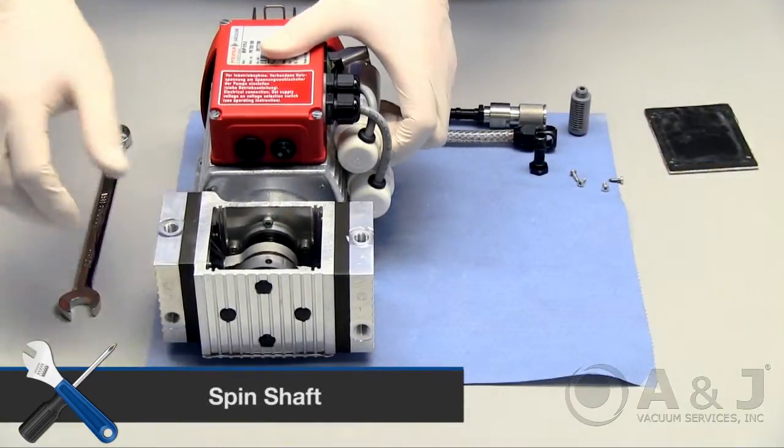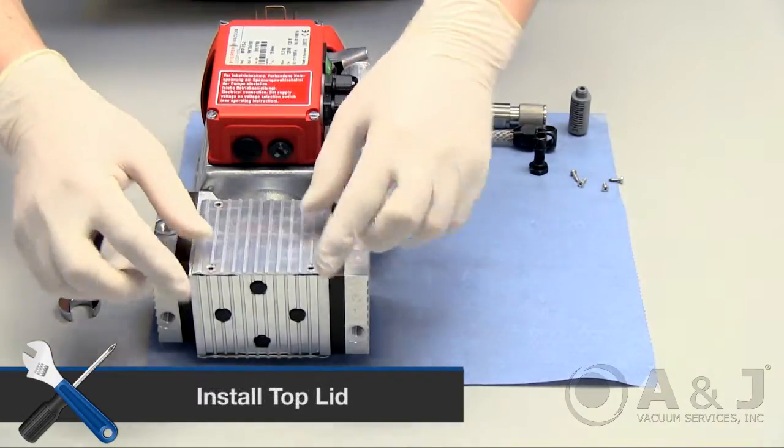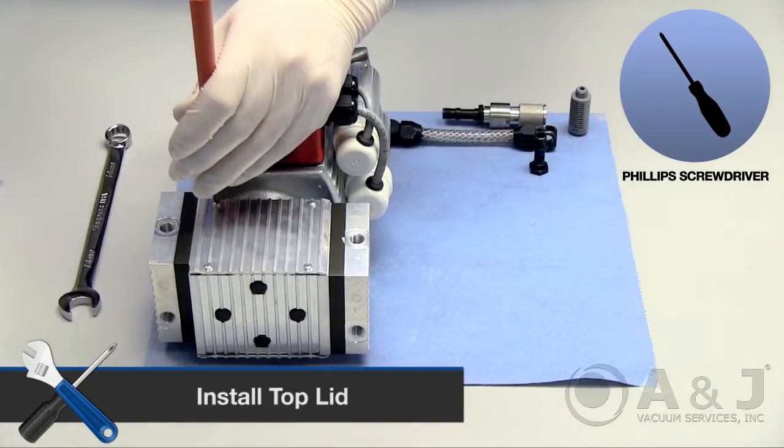Before sealing the shaft housing, spin the shaft to make sure everything is moving properly. Place the lid on top and screw back into place with a Phillips screwdriver. Screw in diagonal screws first to ensure equal tension is distributed on the lid.